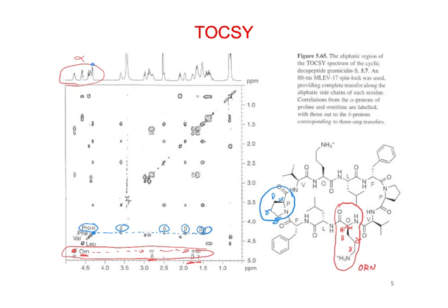I'll show you in a few minutes that you can look up patterns. For each amino acid, there's going to be a certain pattern of peaks that would show up. So you can essentially identify what amino acids are there by all these patterns coming off the alpha protons. That's cool.